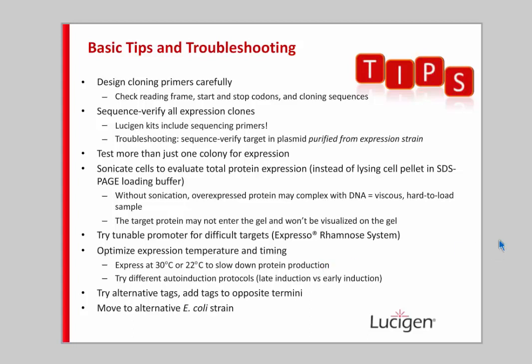And if you happen to be running into problems with your expression projects, one of the things you might want to do up front is to sequence verify the target that has been isolated from the expression strain, to make sure that there are no mutations occurring in that expression strain after transforming the expression strain. And we also recommend sonicating the cells to evaluate total protein expression instead of resuspending in SDS-PAGE loading buffer.